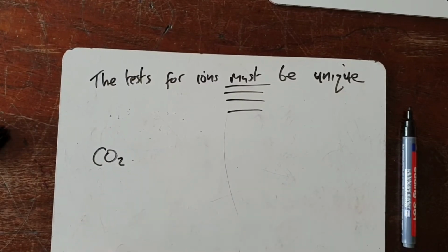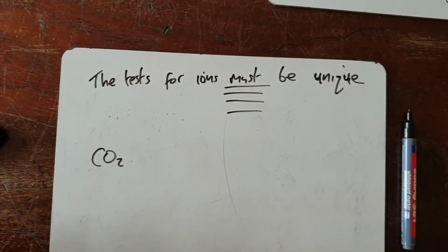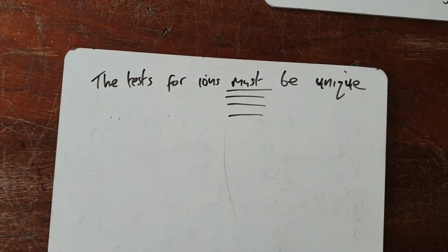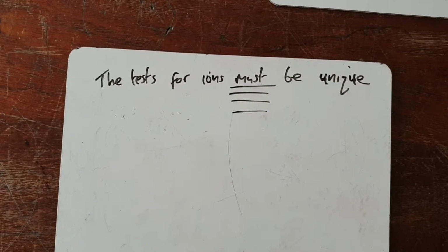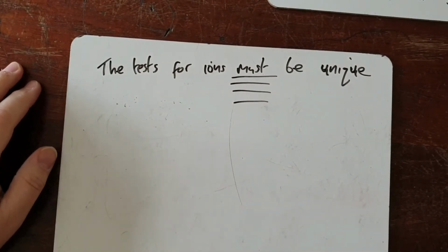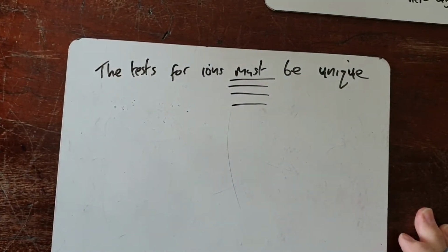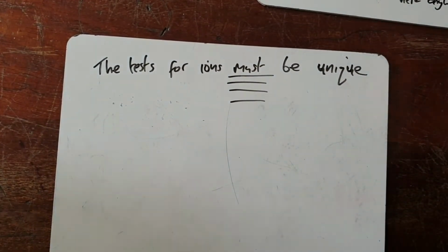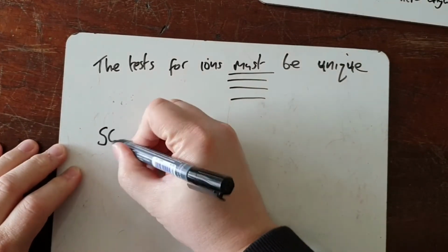Right, so I've got some practical stuff set up now, which I'm going to try and film, so hopefully it will come out quite clearly. The first test I'm going to look at is, where are we? Not that one. Right, we'll do sulfate ions first of all.